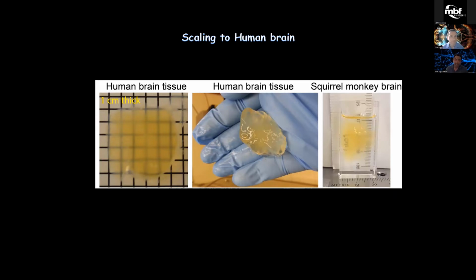So from the imaging side, it also presents another set of challenges in the light sheet microscopy context. Right? So if you look at light sheet microscopy, it has an orthogonal geometry. You have these light sheets that you are generating 90 degrees to the detection arm, and they need to travel through the tissue to illuminate the plane that you are trying to image, right? So that puts a hard limitation, first of all, on the sample size.